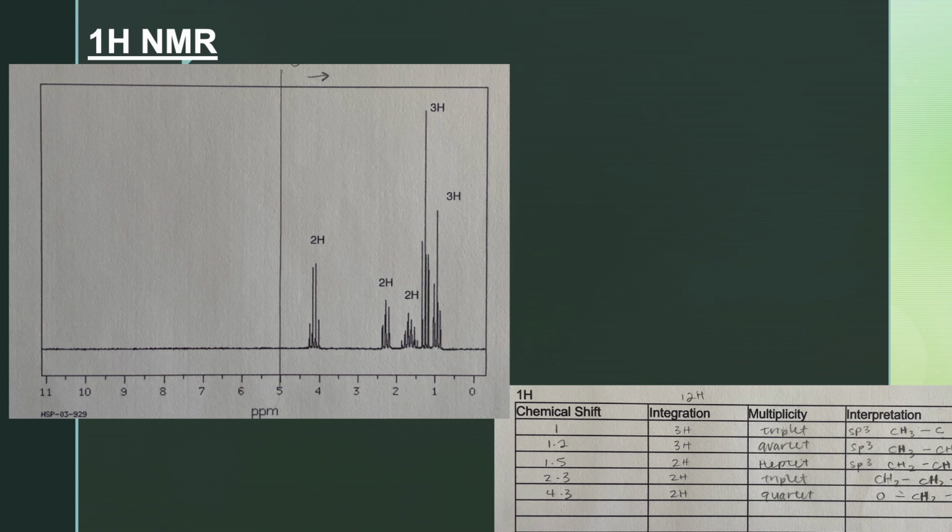And finally, we're looking at our 1H NMR peaks, and the multiplicity is really hard to look at on here, but what is given is our integration. So we can look at all those integrations, and we know we're working with 3 H's, and we're working with 2 H's. So that's this right here.